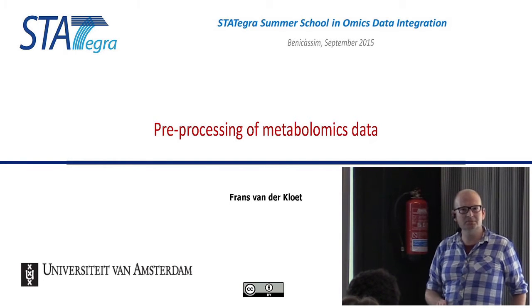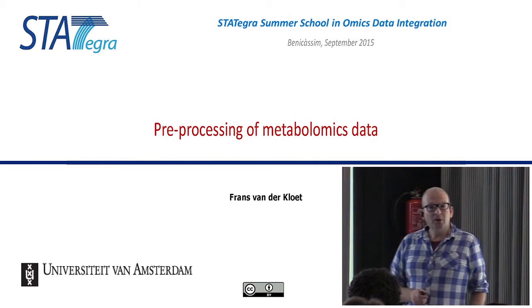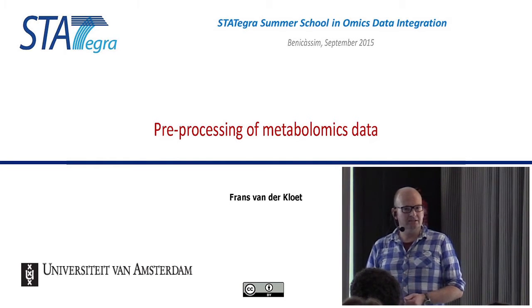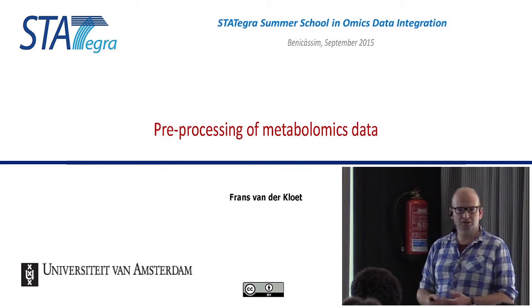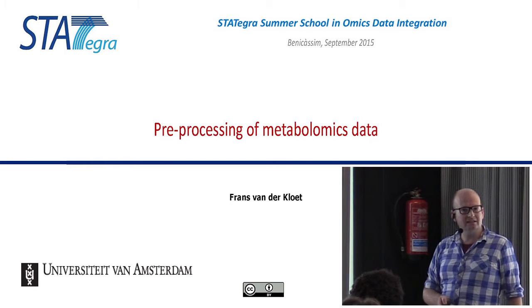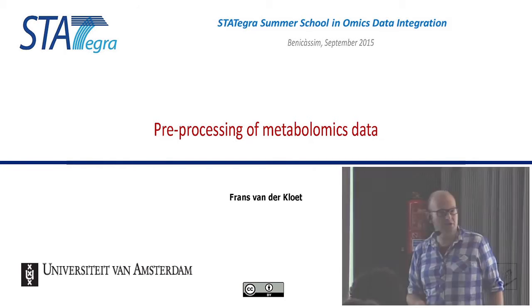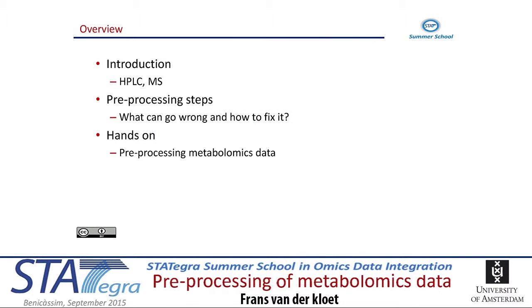I won't be talking about the data analysis of the metabolomics, because the next lecture for me will be about component analysis and combining data sets, so data fusion, which is more of a data analysis issue. I won't go into the details of the data analysis, just the pre-processing of metabolomics data itself, which is hard enough.